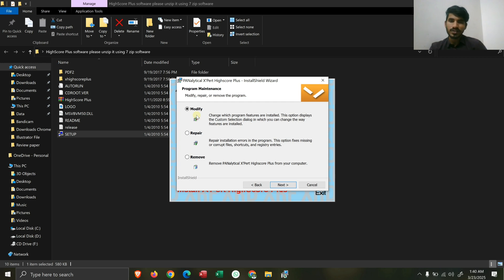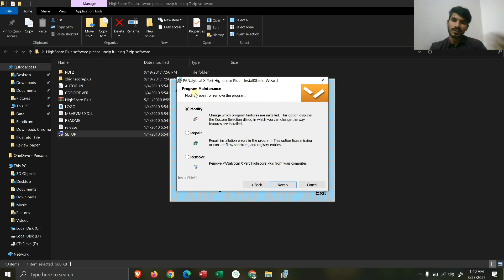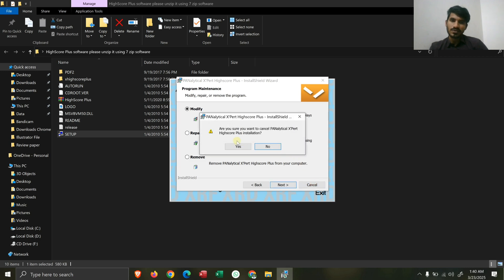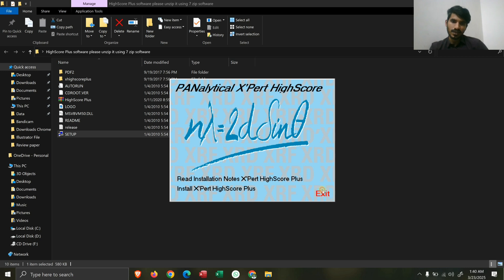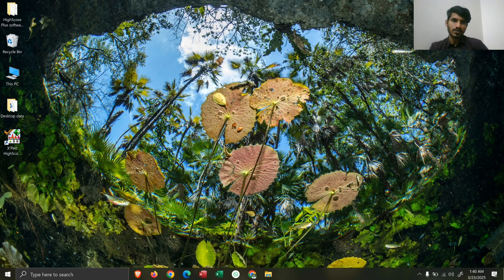If you do not have Expert HighScore already installed, the setup will directly lead you to the screen for clicking the install button. After that you will have to click the install button. I'm cancelling here because I have already installed it. After installation is complete, you can just click Finish and then click Exit.